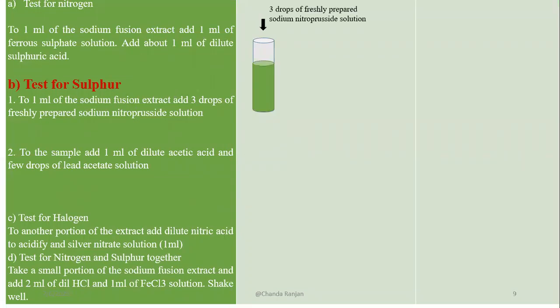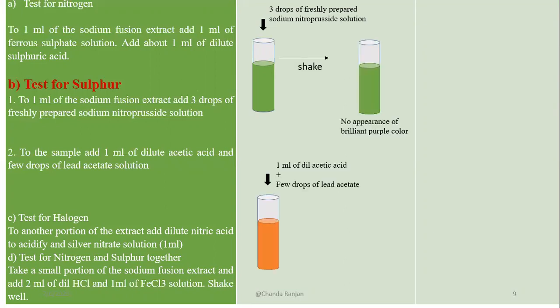Now we test for sulfur. We take 3 drops of freshly prepared sodium nitroprusside solution, shake it — no appearance of brilliant purple color, showing the absence of sulfur. We also perform the lead acetate test: we add 1 ml of dilute acetic acid and 2 drops of lead acetate and heat it. No appearance of black precipitate — this confirms sulfur is absent.